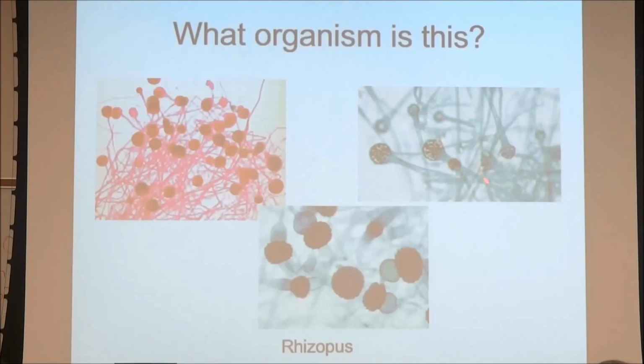Okay, well, none of you really did, so let me talk. These guys right here. Remember these lollipop-looking guys? You had to draw this. This circle, or the head of the lollipop, is the sporangia. Because you can see the sporangia and then the sticks, which are the hyphae. So you have the sporangia and the hyphae. That's what tells you it is Rhizopus.